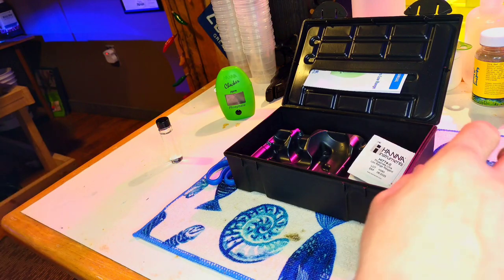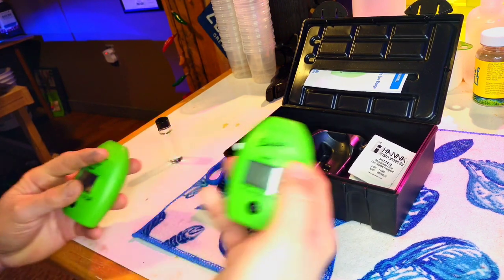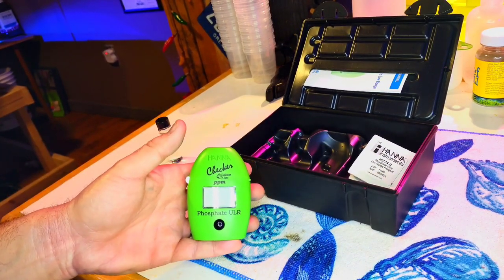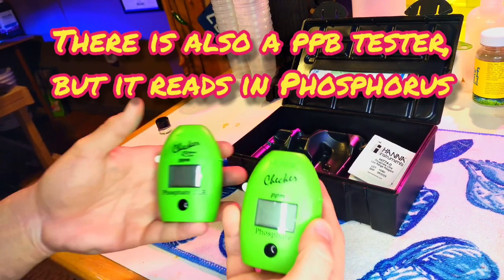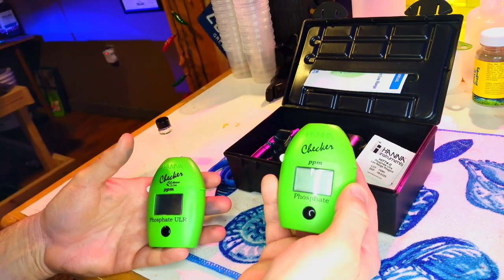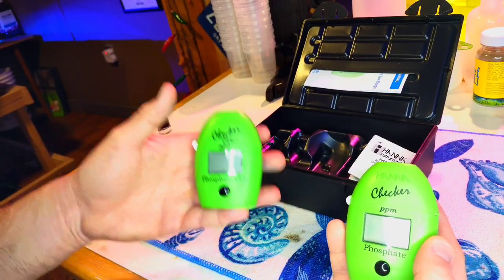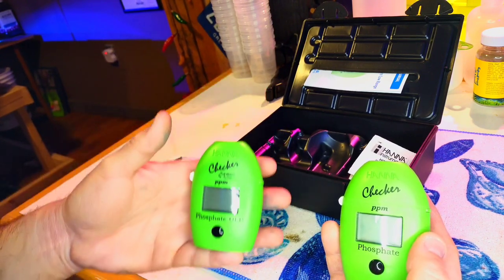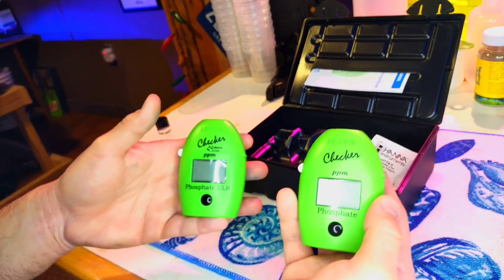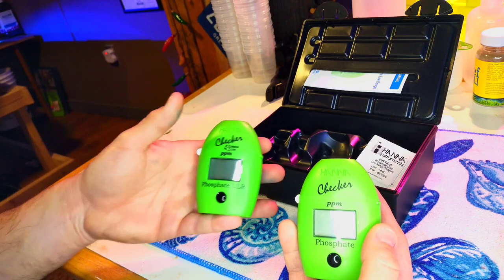For marine tanks, there are two different phosphate checkers you can use. There's the phosphate low range and the phosphate ultra low range. The only difference between these two is the accuracy. The low range is accurate to 0.04 ppm plus or minus, while the ultra low range is accurate to 0.02 ppm plus or minus. Depending on how tight you want to run your phosphate, that will determine which checker you want. They are pretty much the same price, so the ultra low range one is usually the one people get anyway.